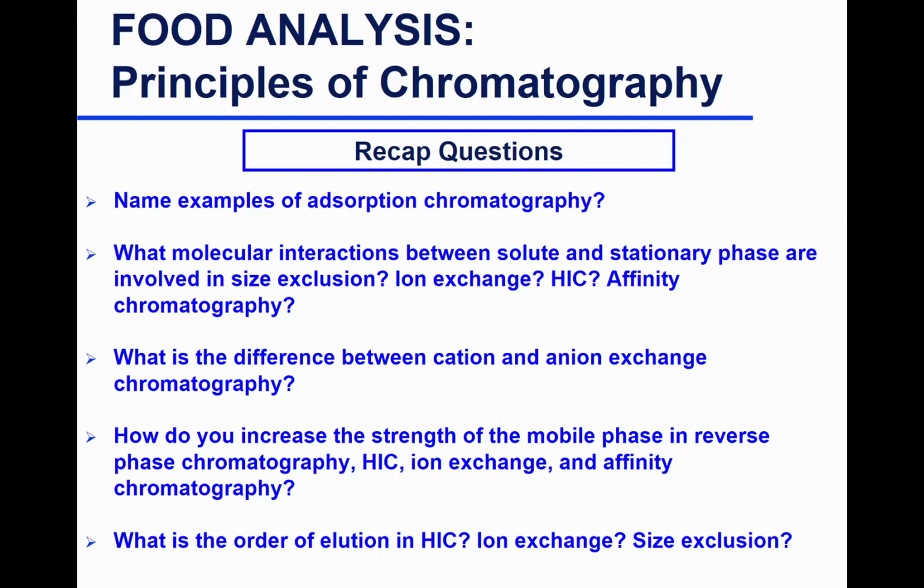What is the order of elution in HIC? Meaning, will the most hydrophobic leave first, or the least hydrophobic, in hydrophobic interaction chromatography? Come on, this is common sense. The least hydrophobic will leave first, because the more hydrophobic your compound is, the more it's going to interact with the column. In ion exchange, will the most charged or the least charged leave first? Common sense? Least charged. In size-exclusion, we haven't talked about that.